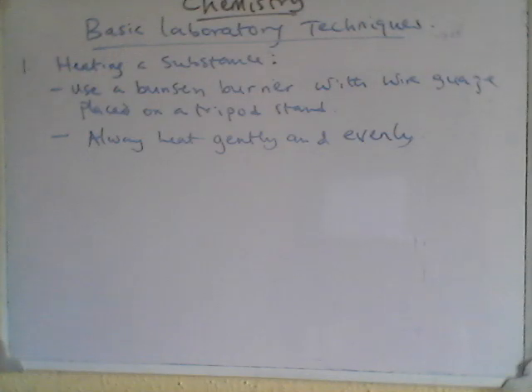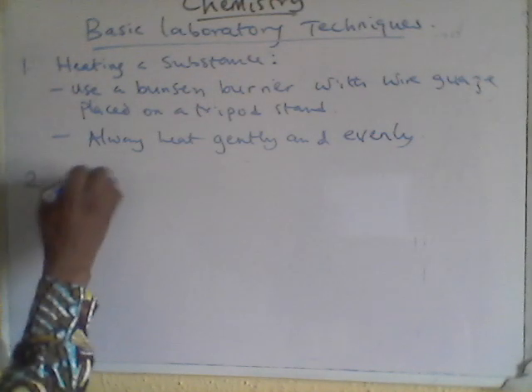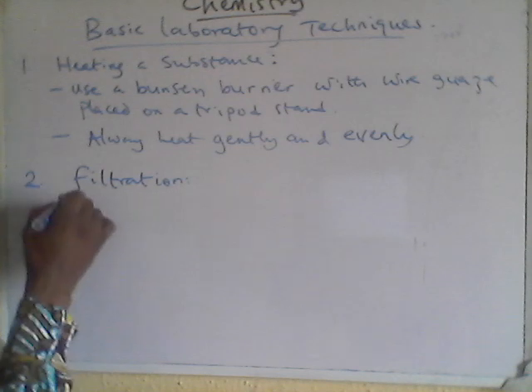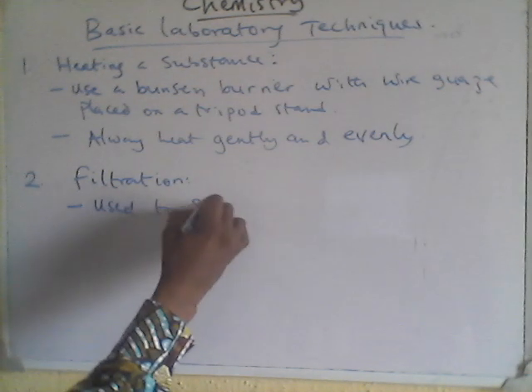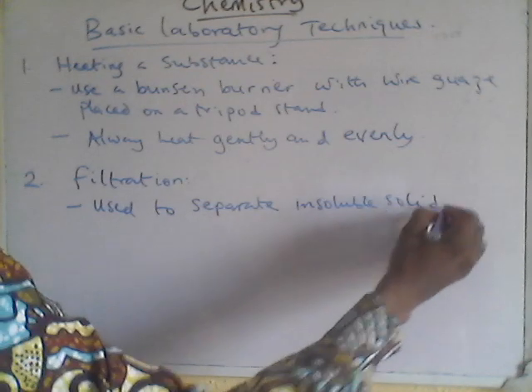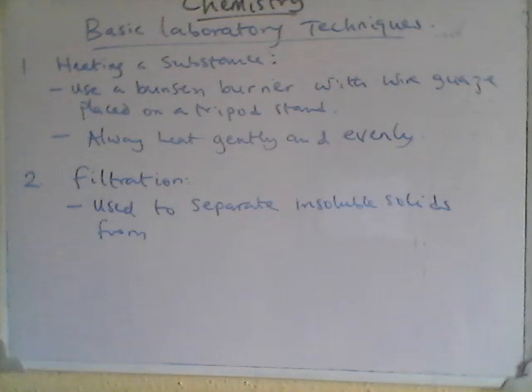Another technique is filtration. Filtration is a process that is always done in the lab. We talked about it in the video that has to do with separation of substances. It is used to separate insoluble solids from solutions or liquids. Remember, insoluble solid means a solid that cannot dissolve.